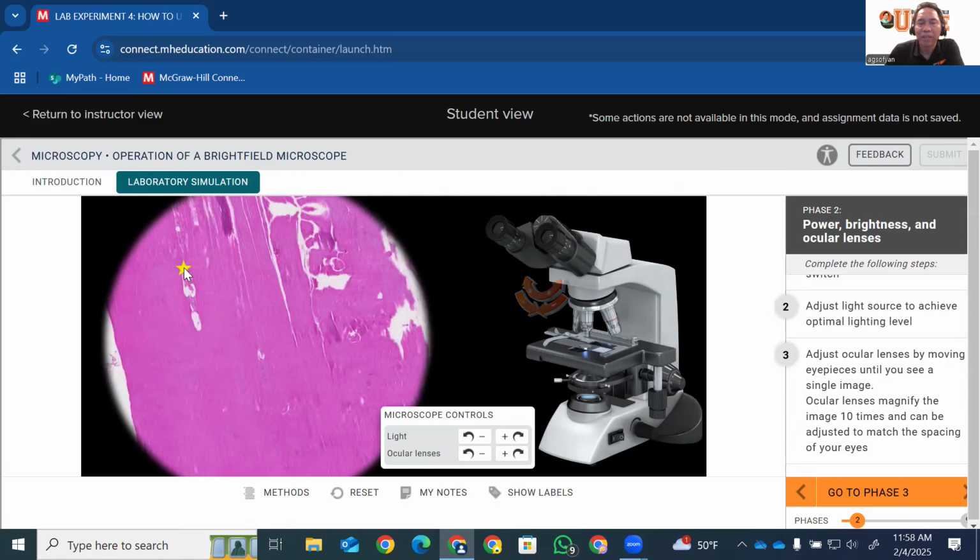Here, you see that one? Now it's good. So the image is not only one. It means that it's focused. So you see that the object here is really clear now. Okay, it's bright and clear. Now what is next? Oh, we're done actually. We have done this.